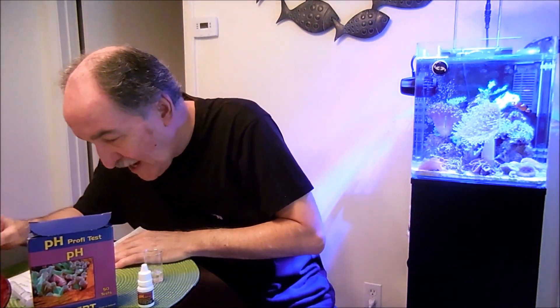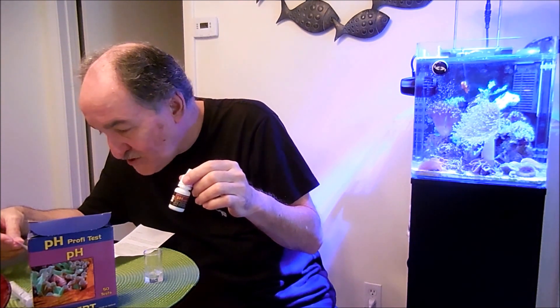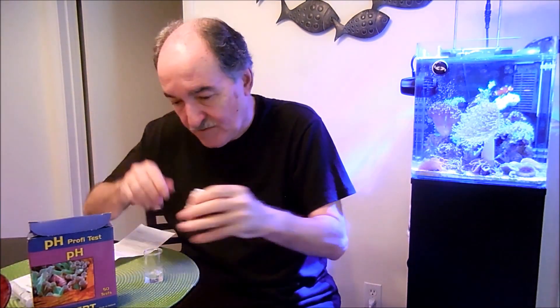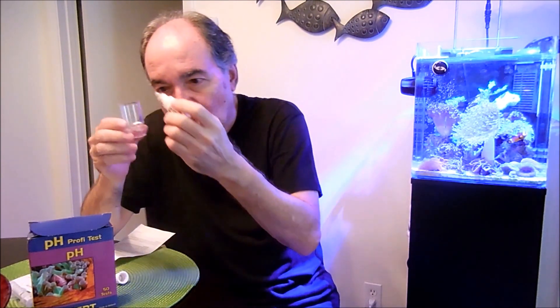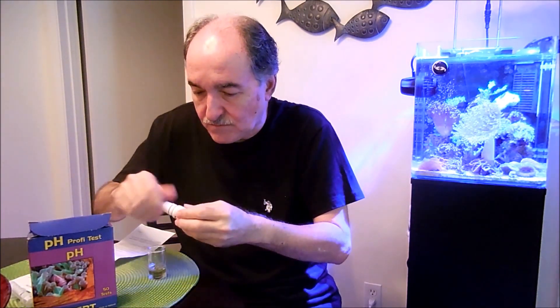The second step says: add 6 drops of the pH reagent and swirl gently for 10 seconds. One, two, three, four, five, six. Let's close this and swirl it for 10 seconds.